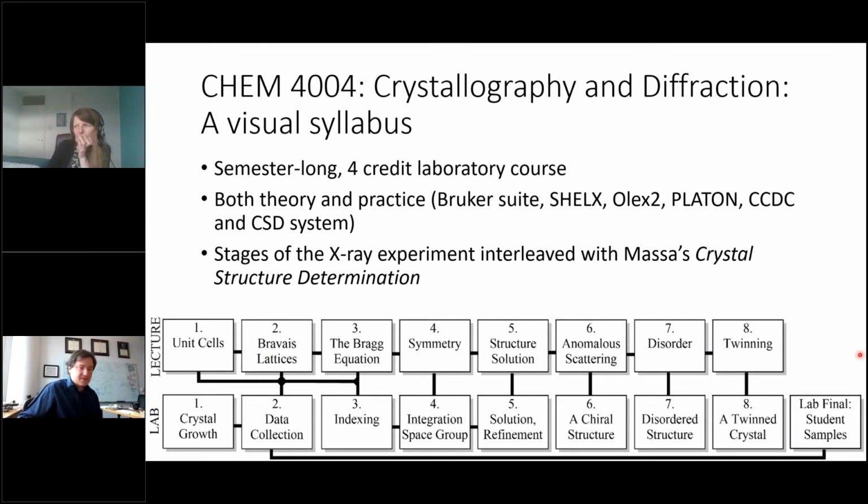And so basically what I have here, and I'm going to refer back to this a bunch, is a visual syllabus of my course. And it's structured based on Werner Massa's book, Crystal Structure Determination, and the top shows how that book is organized and how the lecture topics are organized.